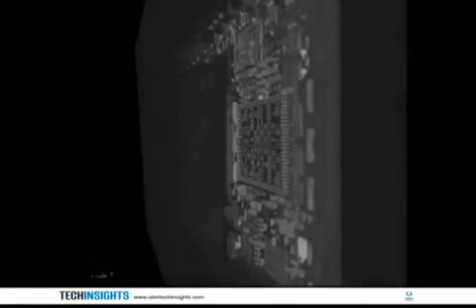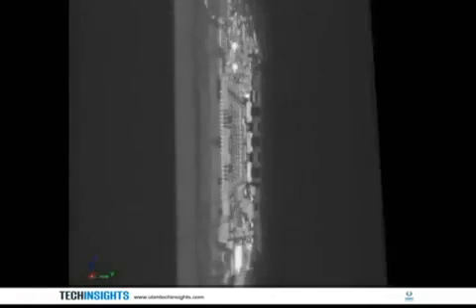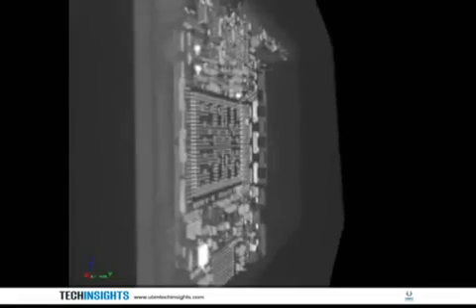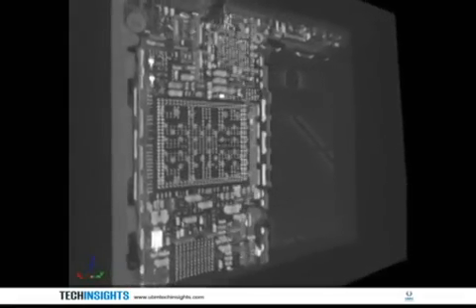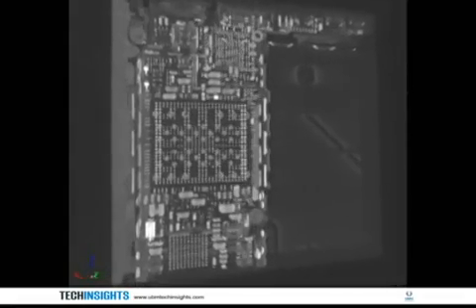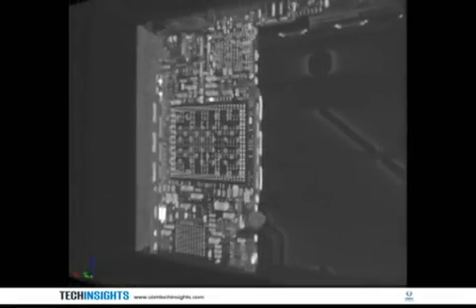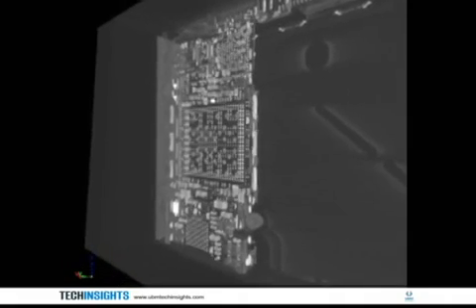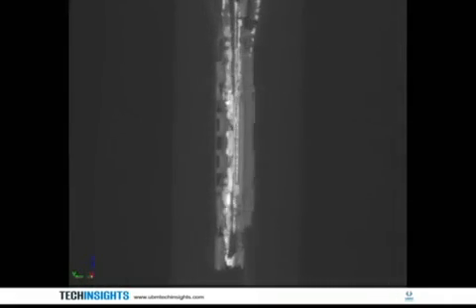Hello, I'm Steve Bitten, a product manager at UBM Tech Insights. What this video shows is a predetermined piece of the iPhone 4 x-rayed slice by slice and pieced together to make a full 3D image.